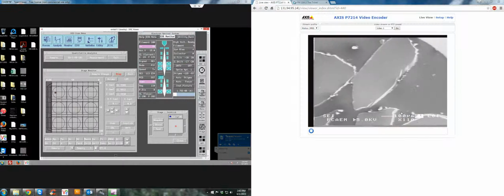And you want to do this anytime you move to a different sample, even a different location, because I guess the elevation or the relief changes at this scale very quickly, so you want to make sure you're always in focus with your OMTV. There are two things I forgot to mention in the previous video that I'm just going to add on to this.